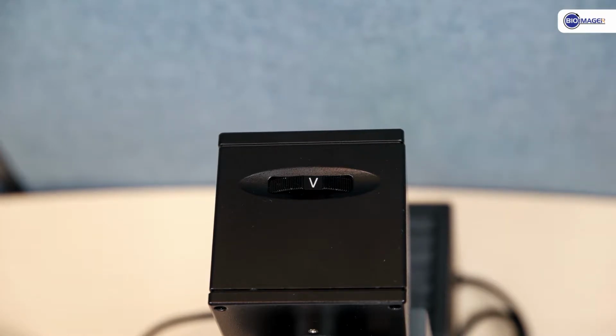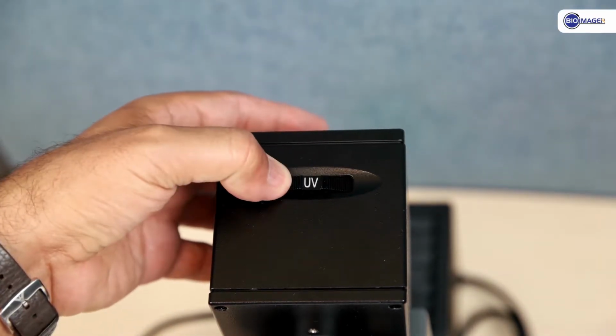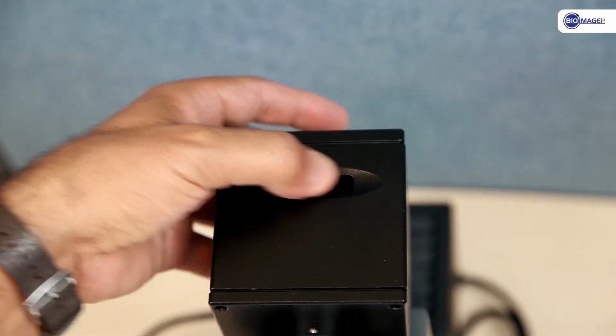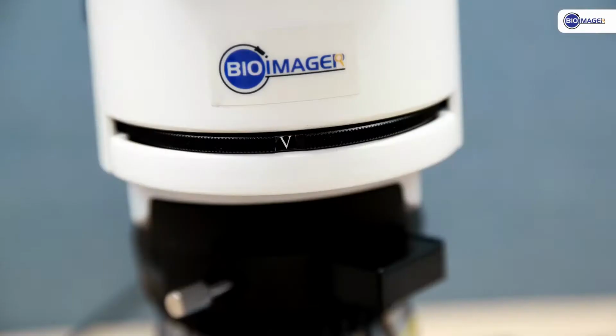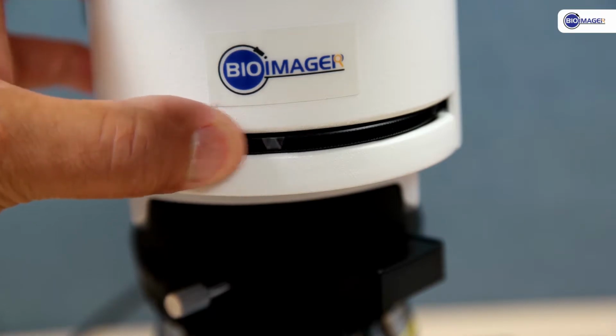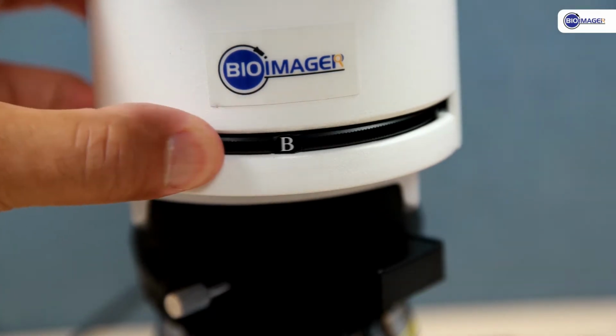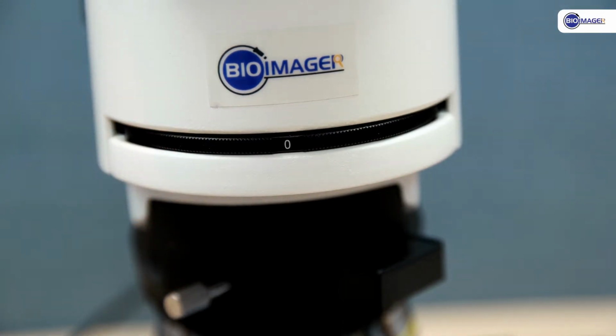At the back it comes with a lamp house which includes 4 different LEDs. By default you can get violet, ultraviolet, blue and green excitation LEDs. You can also get a custom LED such as red or infrared. At the front this has a filter wheel which includes again violet, ultraviolet, blue and green filters, plus 1 empty filter spot for bright field imaging.